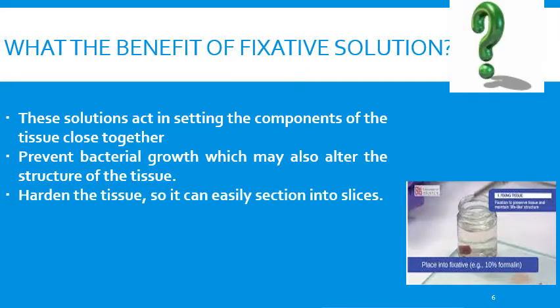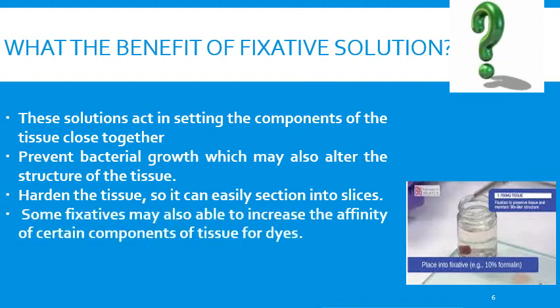Harden the tissue so it can easily section into slices. أيضا تعطي صلابة للنسيج وتسهل عملية التقطيع إلى قطع صغيرة. Some fixatives may also be able to increase the affinity of certain components of the tissue for dyes. يعني يزيد من قابلية هذه المكونات النسيج إلى الصبغات.